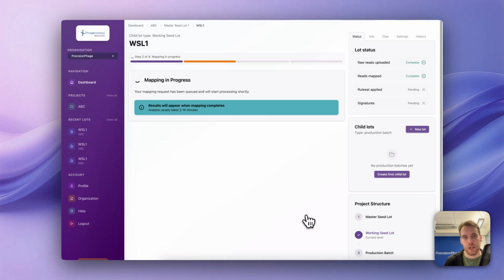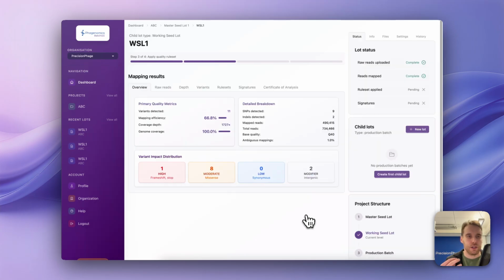You could have a bioinformatician running a bunch of different tools, starting from quality control, progressing to mapping, and then analyzing that mapping data. While this is certainly doable, it's very unscalable. And the fact that for GMP phage production you need to be able to standardize and validate these procedures makes this a complicated issue. So what we've done with BatchQC is that we've abstracted all of this under one package, and not only the bioinformatic pipelines, but also the document governance, which I will return to in just a moment.